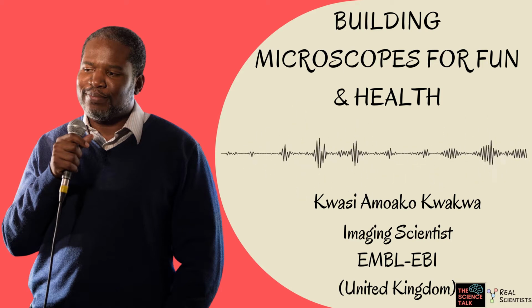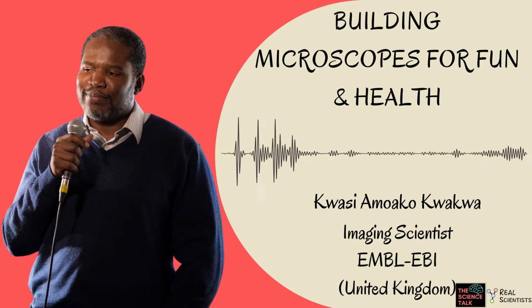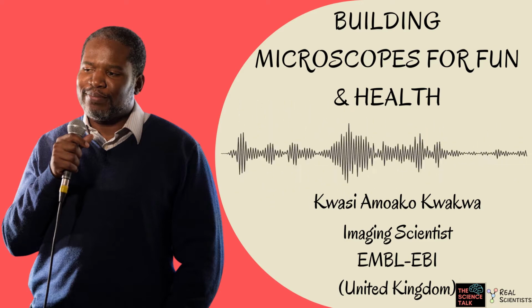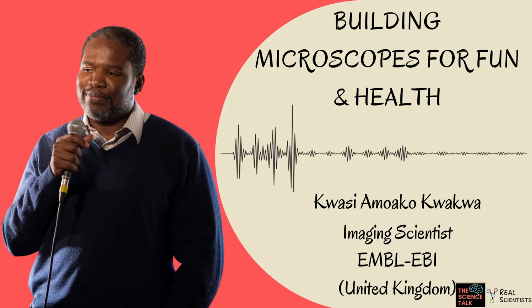So let's start by understanding your work. Could you explain your research to us in super simple words, please? Okay, I'm an imaging scientist, which is a general term for people who mess around with microscopes and other imaging platforms. What I've done across my career is build microscopes or manage microscope systems that are used for imaging, usually biological samples. So it's usually looking for activity going on inside of cells.